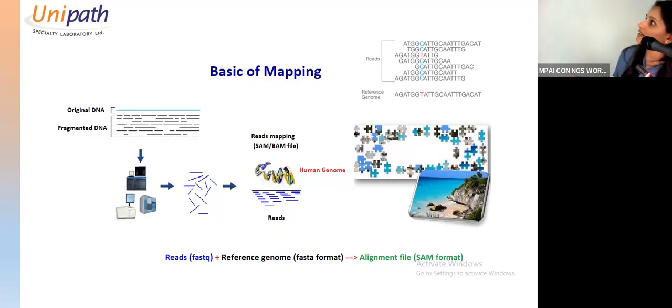But as you can see here, in the reference it was T. But here, in this particular sample, it is C. In one of the sequences it is T, and again it is C. So it is a mutation. Heterozygous or homozygous, that again depends on the reads.